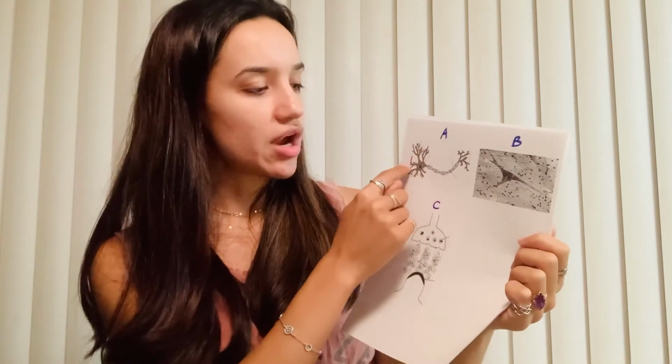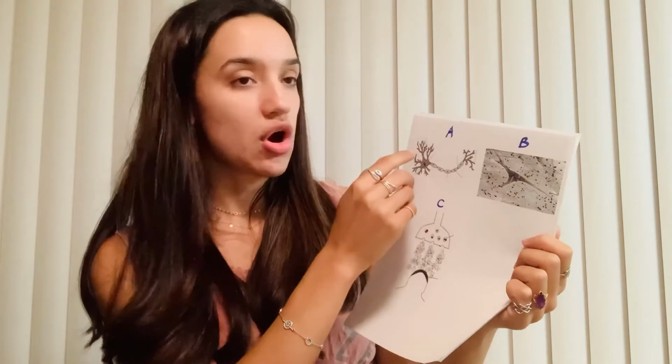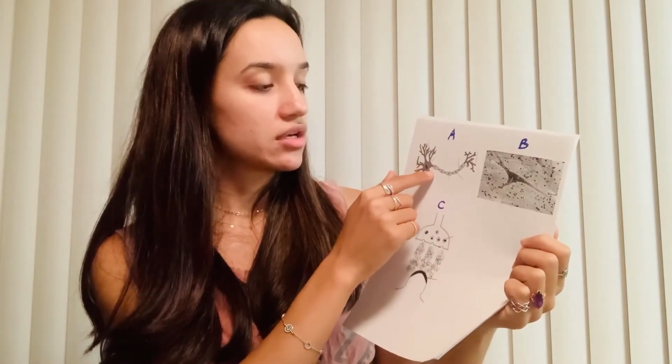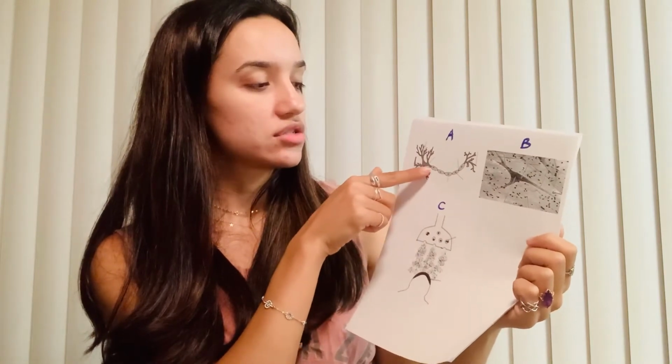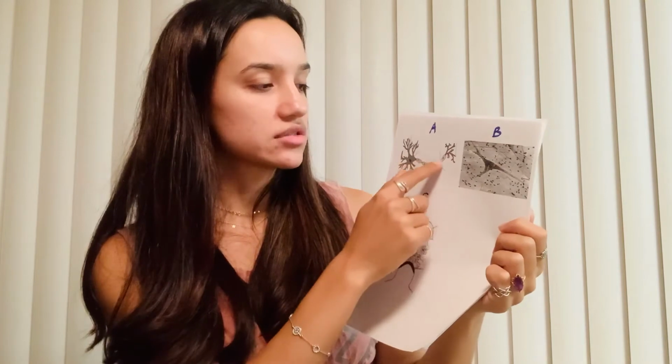We have dendrites, and the dendrites are in charge of taking the electrical impulses to the cell body and through it to the axon. This structure right here is the axon. These cells here are the Schwann cells, and their purpose is to create myelin sheaths.